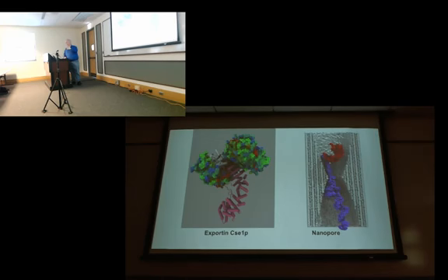But when you start making movies that you want to present in a scientific lecture or something like that, some of those trade-offs are not very good for what we do, because you see strange fluttering and things like this in the corners of the image, and for a scientific presentation, that would be too distracting. In a video game where you're just trying to kill the opponent, it really doesn't matter, right? So you forgive a lot of things for a video game. So that's the thing with ray tracing, we don't take any shortcuts. We do it the hard way, and we get results that are more predictable.